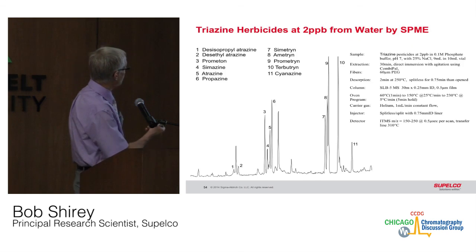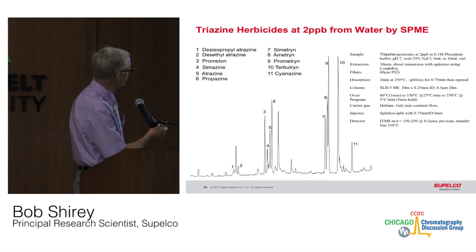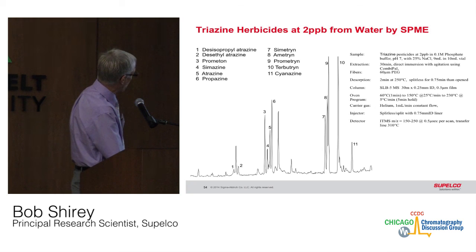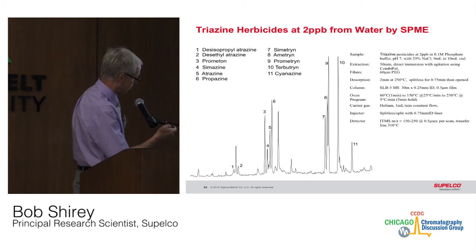Some applications by direct immersion. These are herbicides at 2 parts per billion. They're fairly polar, moderately basic herbicides. These are breakdown products where the isopropyl and the ethyl groups have been removed, making them even more polar. You can see we're still extracting these using the polar PEG fiber and the addition of salt to the water.